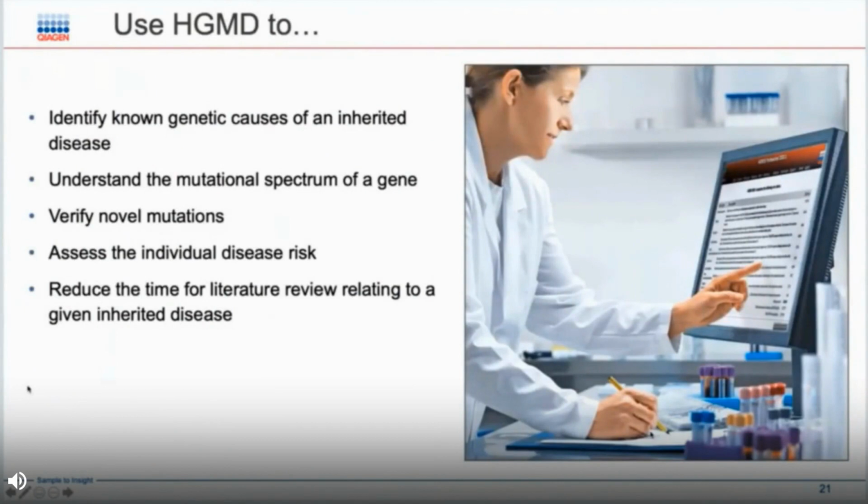And there are different ways that you can use the data to visualize or to annotate, to help with other aspects of analysis. And you have many different options for searching for this information, by phenotype, and in that advanced search where you can export and then move on to help design a panel based on a phenotype.